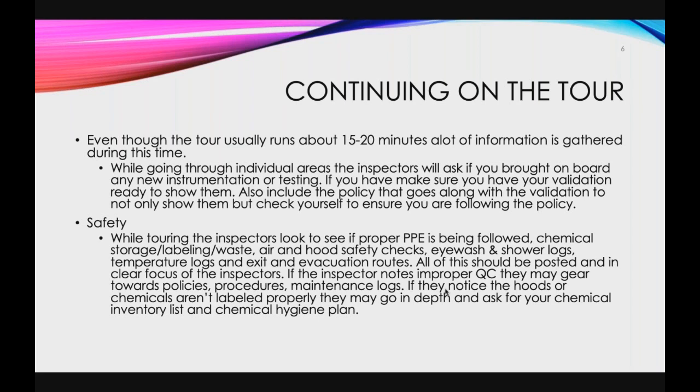The eye wash and shower logs, which should be posted by the areas. We used to have it in a QC book, especially in the morgue. And one of the recommendations was, no, put it out there so you remind not only you, but your staff that I need to fill out this QC for the eye wash and the shower. And also just make sure it's always cleaned, it's wiped down. If there's any dust on it, make sure that that's all cleaned out. Temperature logs of whatever is posted. They'll go more into depth when you do the tracer, but for right now, we're talking about the tour, and this is what they tend to focus on.